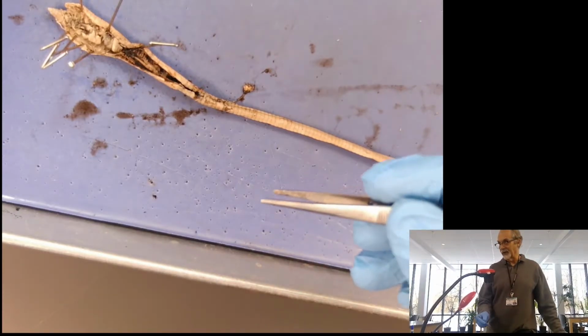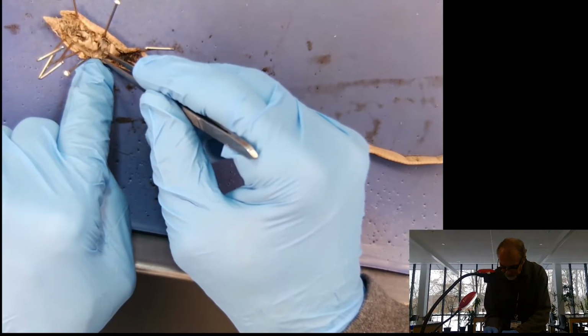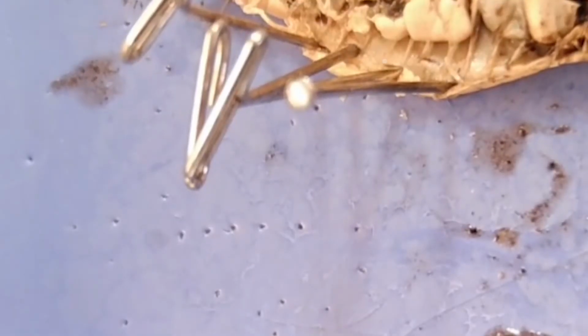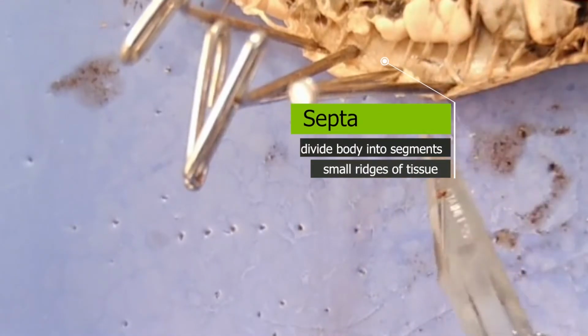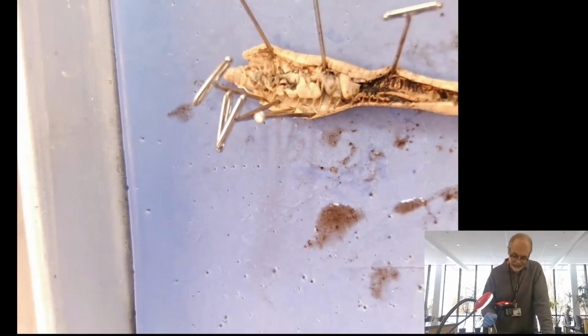So if you have over 100 segments, obviously each segment would have one of these septa, or dividers, on either side. Now I was going to point to something because it's pretty visible. That's excellent, because look, you can see the septa here. Yeah. See there? And those are the little dividers between each of the 100 segments that they have.